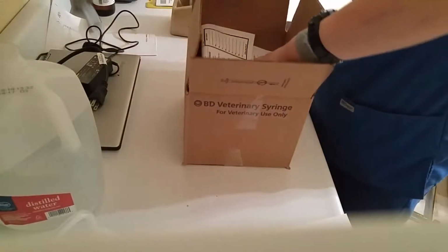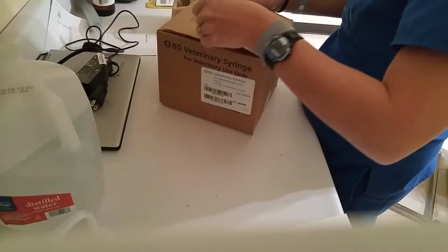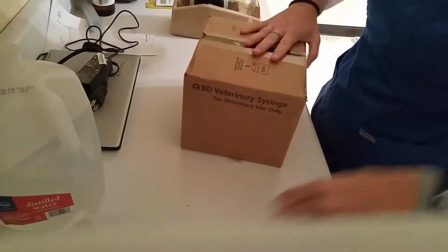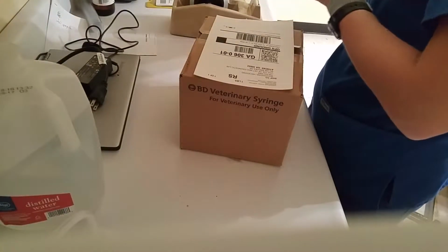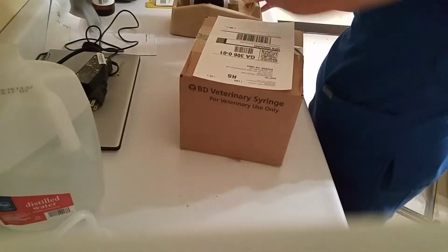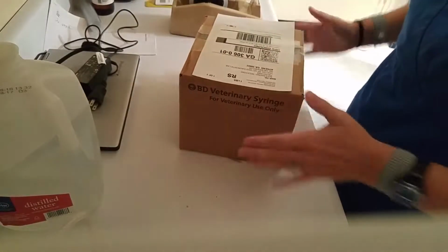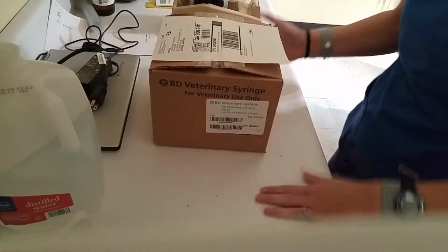I'll go ahead and tape up the box. And I've already got my label printed out, so I'll go ahead and add that to the top here. Stick it in an envelope here in just a little bit, and then we'll send it off to the lab, and then we'll get the results in later.